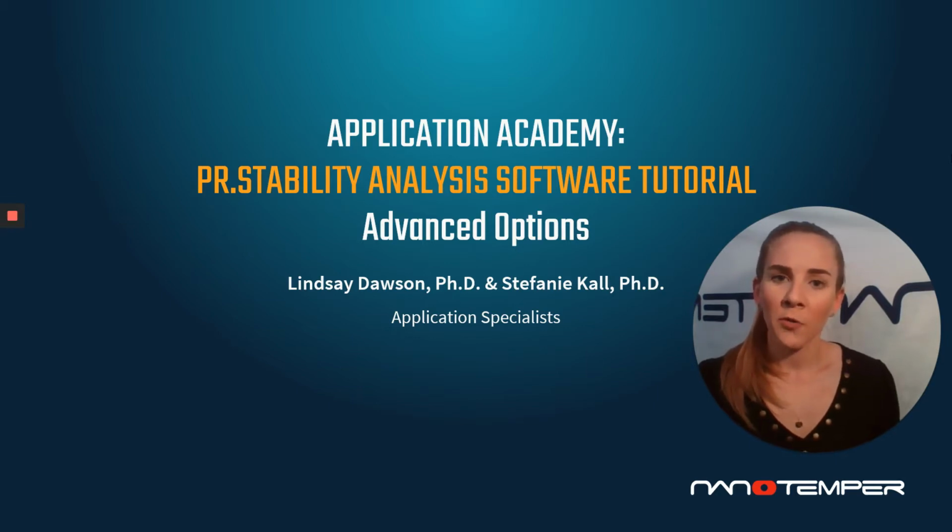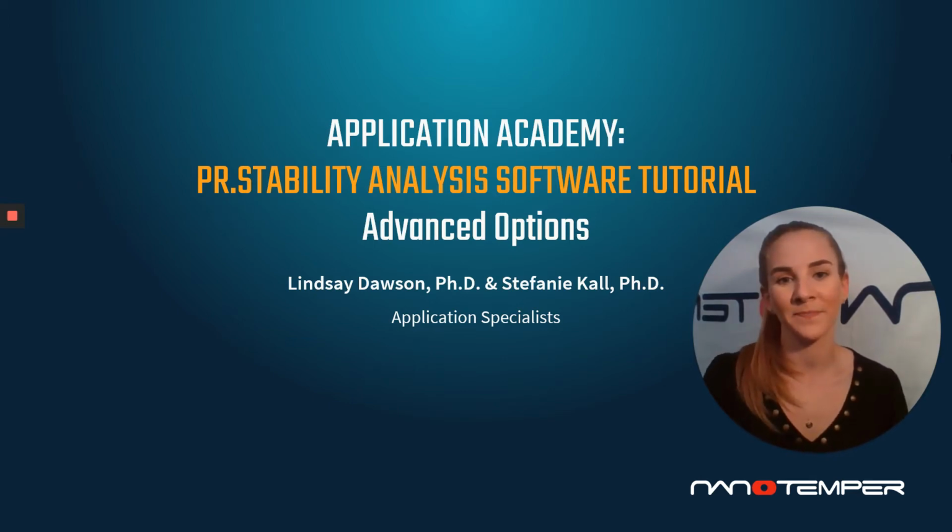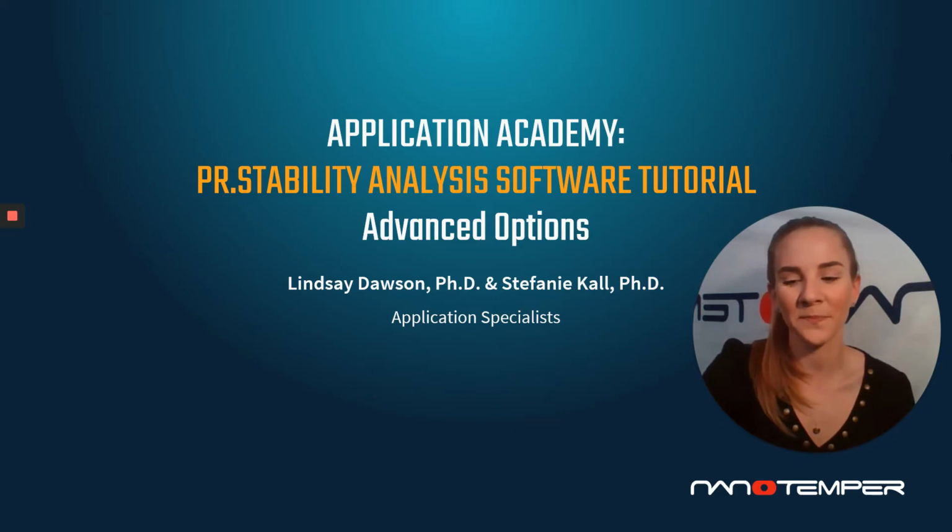So to start out, we're going to walk you through how you can go about customizing the view of your data table, as well as some of those analysis settings. And again, showing you how this is really meant to standardize your analysis workflow, as well as help you to reach stronger and faster conclusions about the stability of your data. Let's jump into the software.